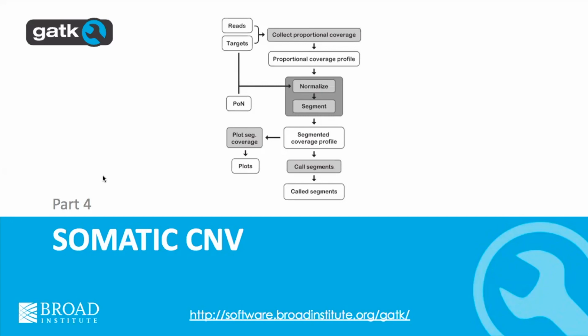Okay, for copy number variation, we're going to look at the data in a completely different way. A lot of the same challenges apply in terms of the heterogeneity of the tumor. But at the same time, you're no longer looking at individual positions in the genome and seeing whether there's a match or a mismatch. You're actually looking at how much coverage you have at any given site, and what that tells you about whether there might be copy number amplification or reduction.